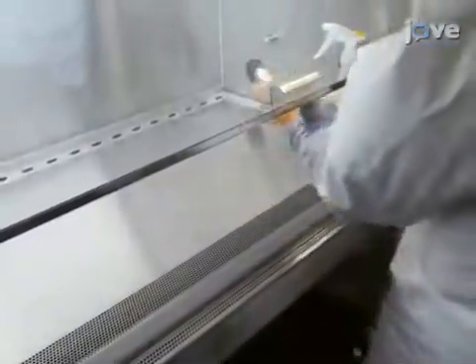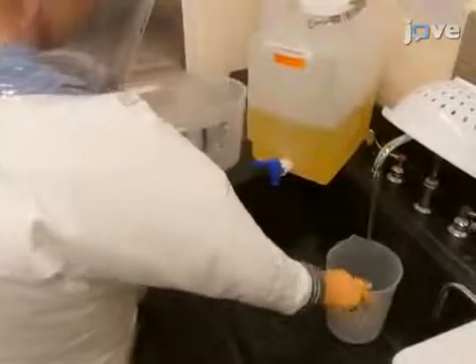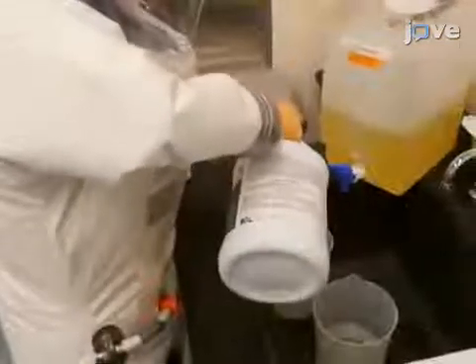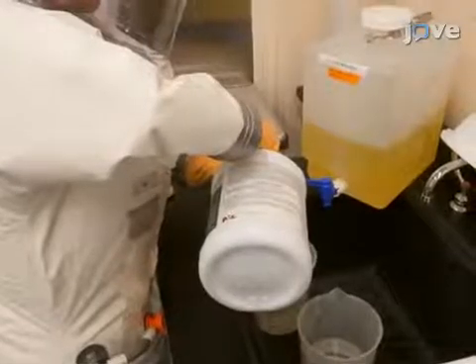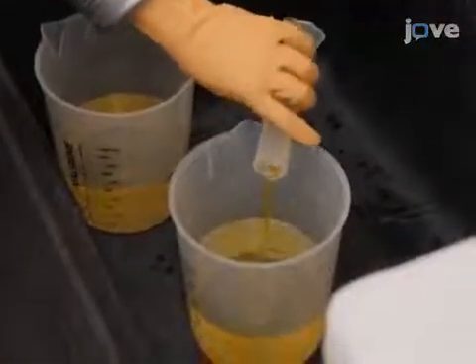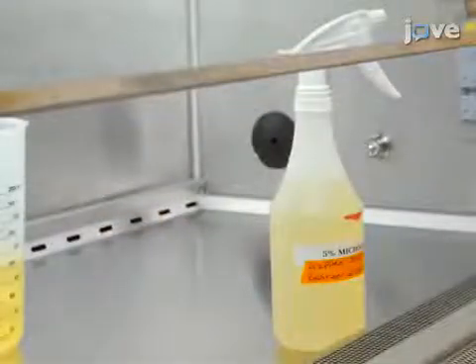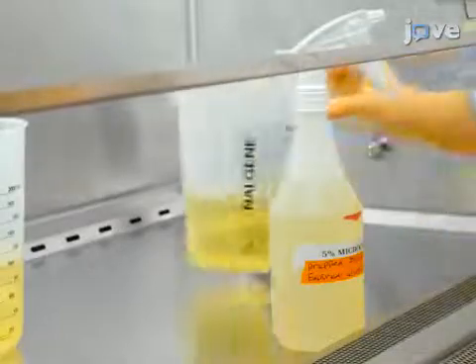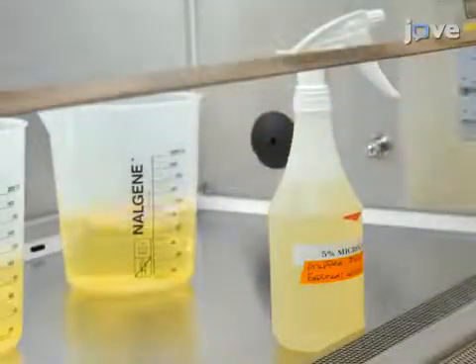Spray 70% ethanol solution inside the cabinet and the sash to remove the tacky disinfectant solution. Prepare a waste container for the biosafety cabinet, ensuring that the final concentration of dual quaternary ammonium disinfectant solution in the waste container is no less than 5%, taking into account any additional liquid that is added. Place the waste container containing 5% dual quaternary ammonium disinfectant solution inside the class 2 biosafety cabinet.